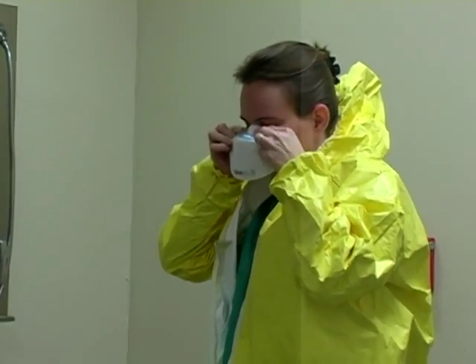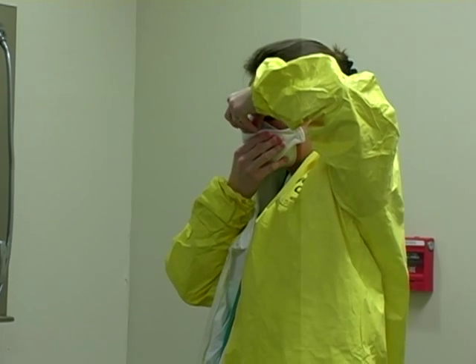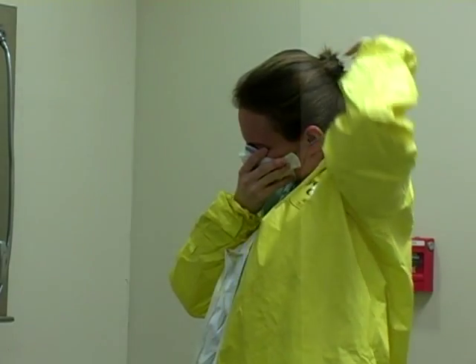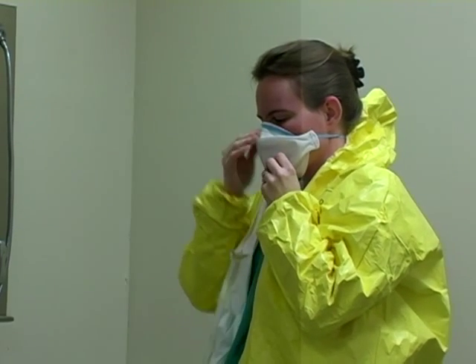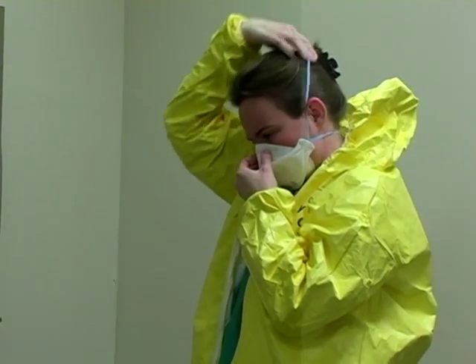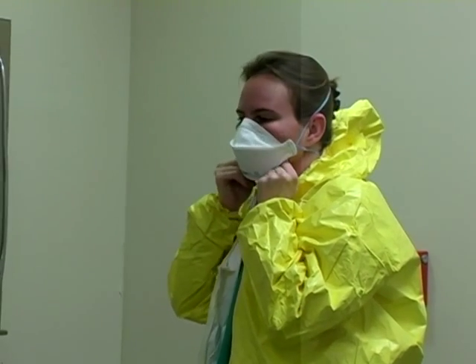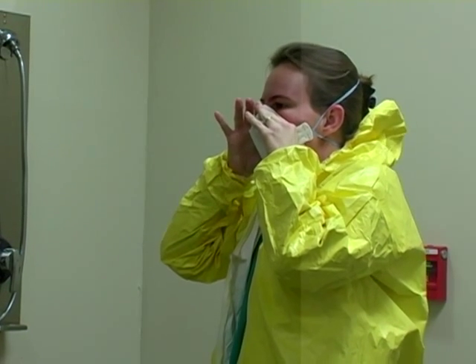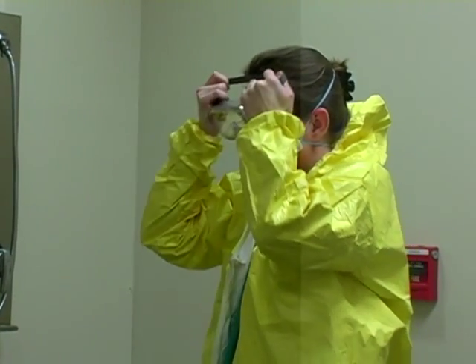Per the manufacturer's directions, apply the respirator. Make sure that you seal-check the respirator. Then apply your eye protector.